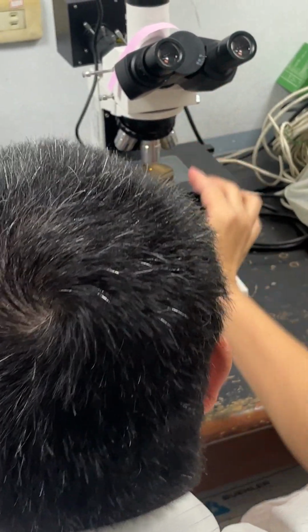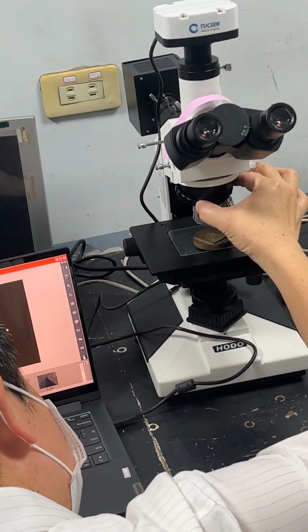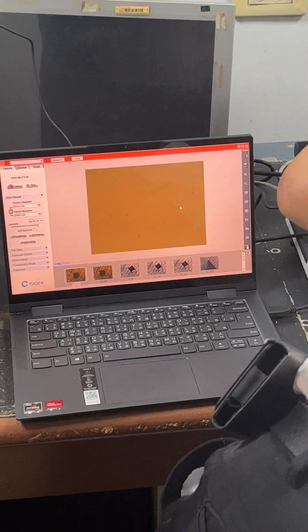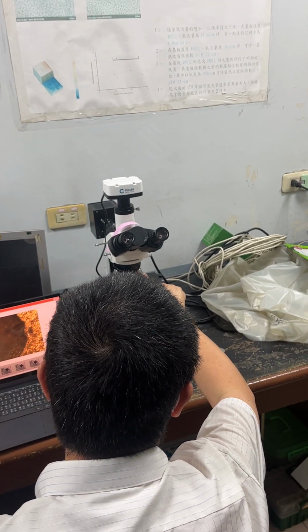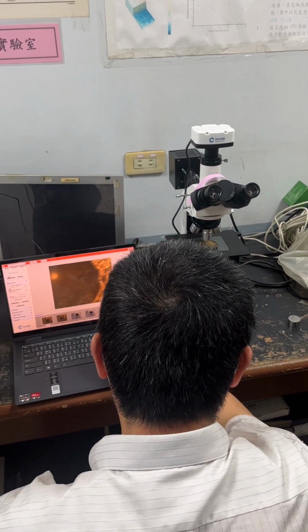This is, let's see. Which is, I can see 10. It's written over there. This is 5. This is 10. This is 20. And okay, this is 10.